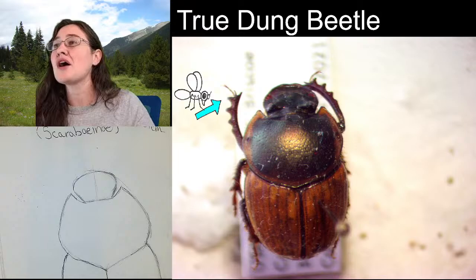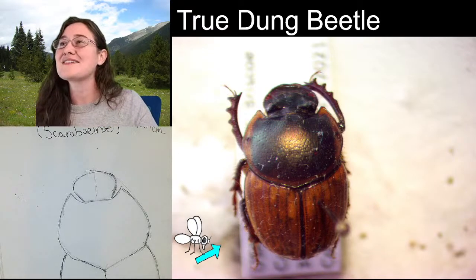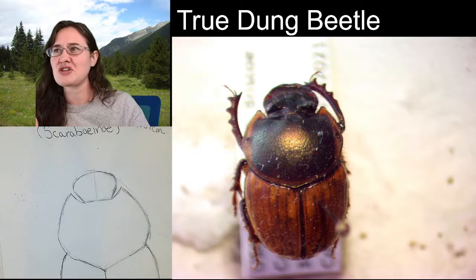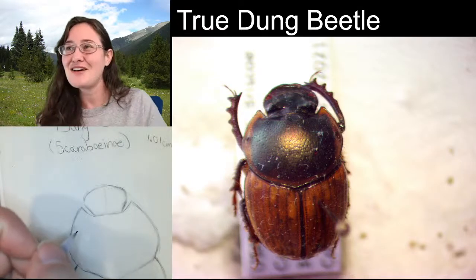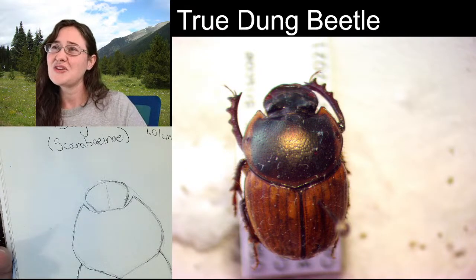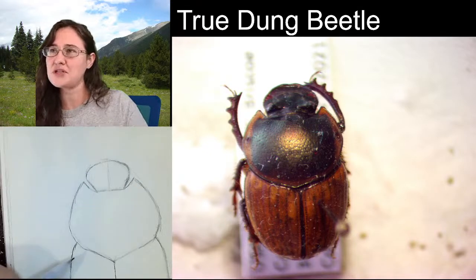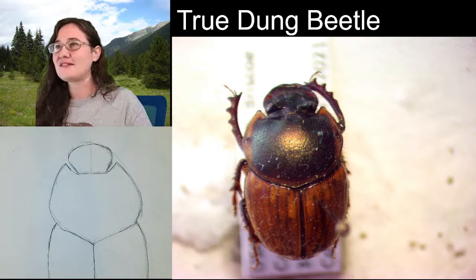And then we are going to be able to sketch all of the tarsal segments. And dung beetles and other scarab beetles have crazy looking tarsal segments. And I'll be able to explain that to you too when we get there. So, all of that to say, you know what? We probably don't need an outline of the legs on these guys. We're probably just going to be using these shapes. Let's zoom in and check out the head.